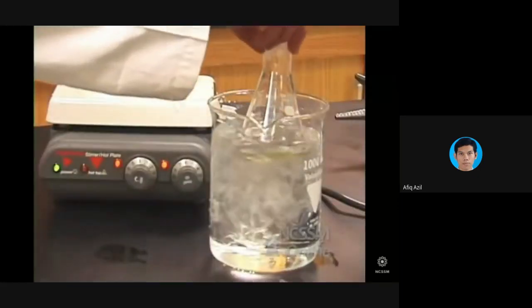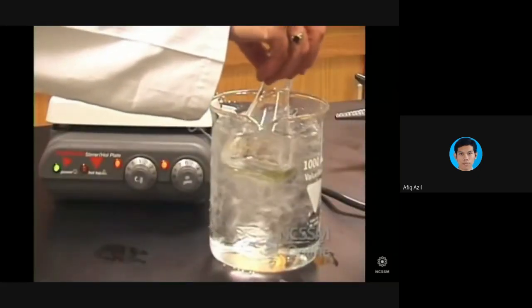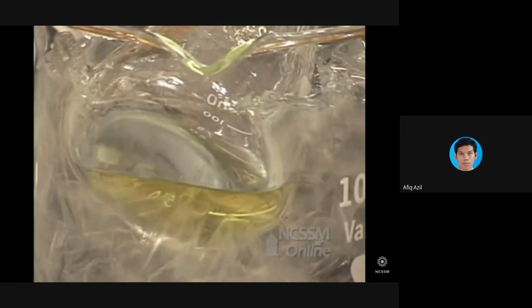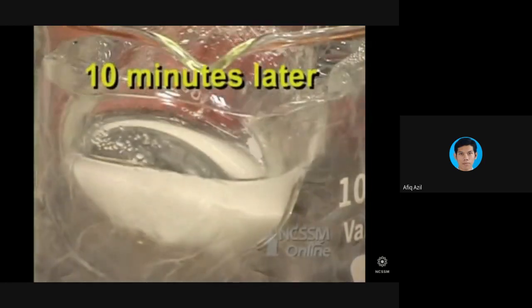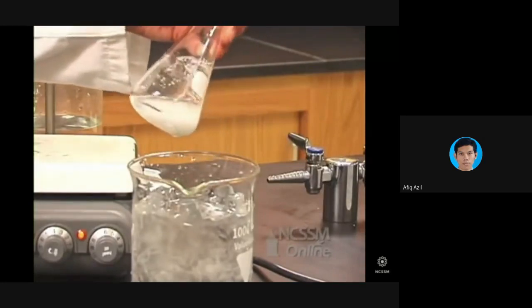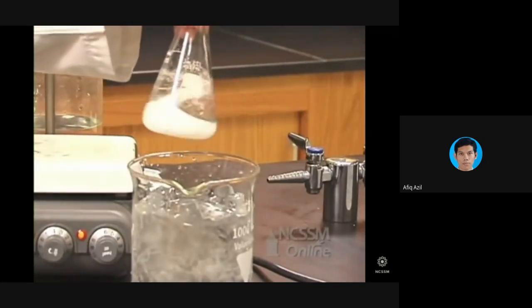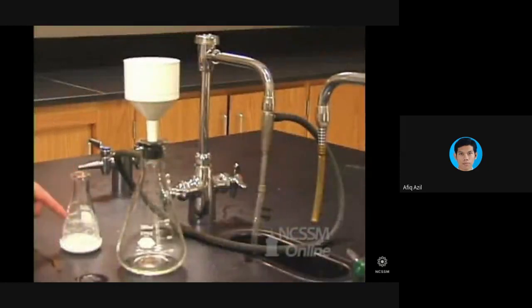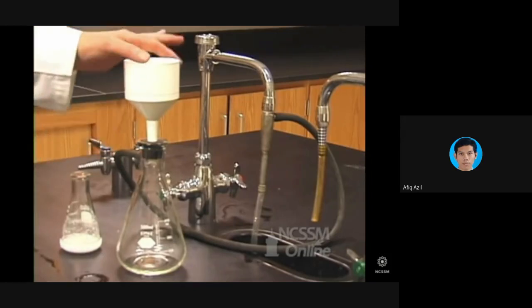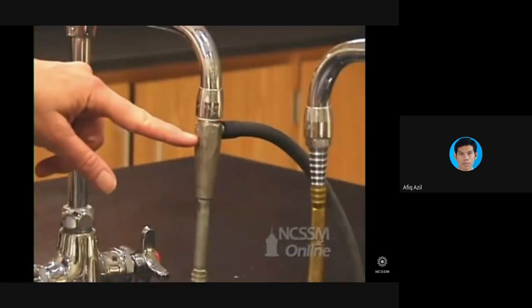Now we're going to put this in a cold water bath and allow the aspirin crystals to form. So you can see we have lots of aspirin crystallized in our Erlenmeyer. Now what we need to do is to filter our aspirin from the solution. And to do that, we're going to use a sidearm flask and a suction filter and this aspirator.